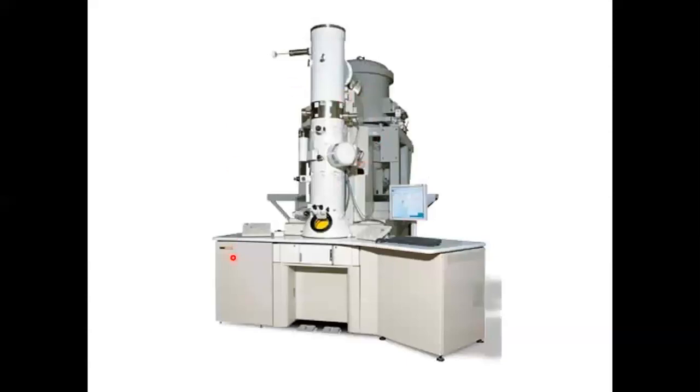This is the body and the whole instrument of the electron microscope. You will find that here I will put the electron beam source, the anode and the cathode, and this is the multiple electromagnetic fields that act as a lens. And here I will receive the image at the fluorescent screen, and edit this image, photograph it and save it through the computer screen and computer PC.